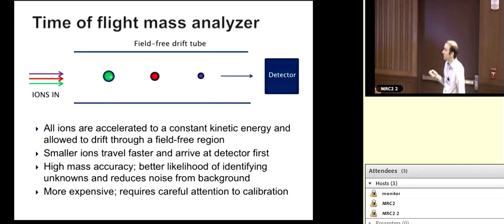Another thing, a trick that we like to use a lot, is to add a stable isotope labeled internal standard. And so this is different from what was mentioned about flux studies where you're using this to trace metabolism. We can just put something in that looks exactly like your metabolite of interest, but it's, say, carbon-13 labeled, and we can measure the extent of ion suppression and compensate for it.